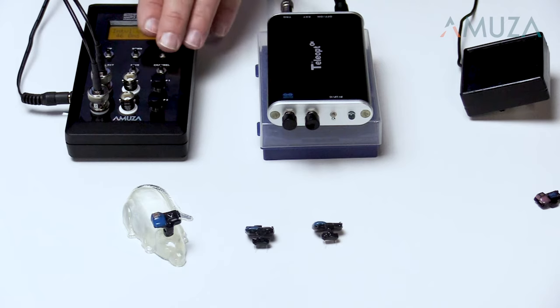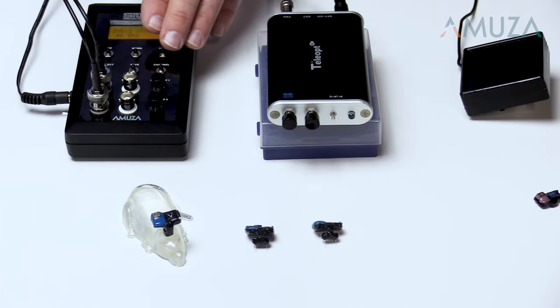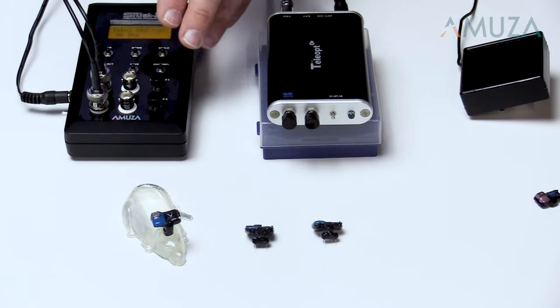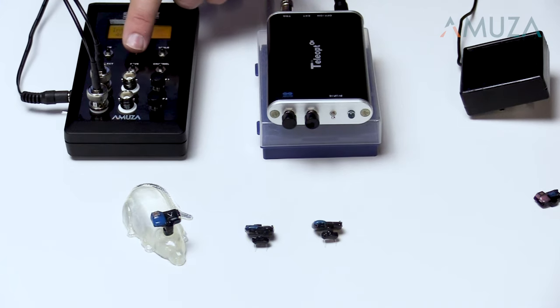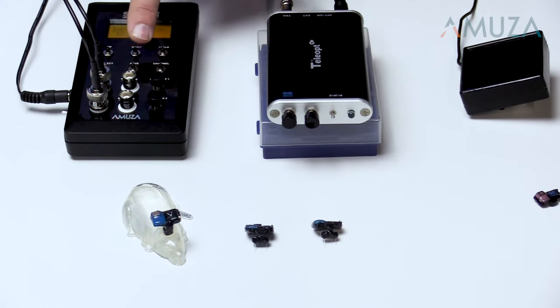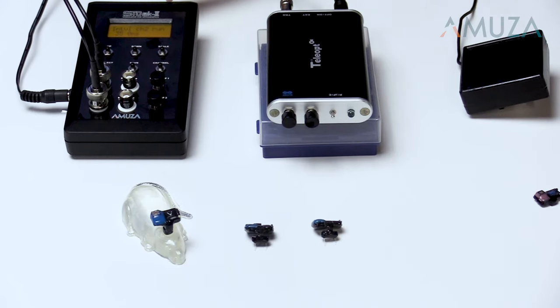Teleopto can be controlled manually, but normally a programmable pulse generator is used to send pulse trains. Our pulse generator is easy to program and use, but if you already have one, you can also use your own pulse generator or stimulator with Teleopto.